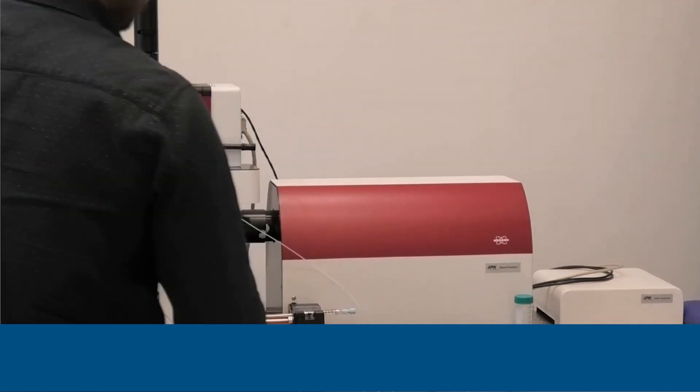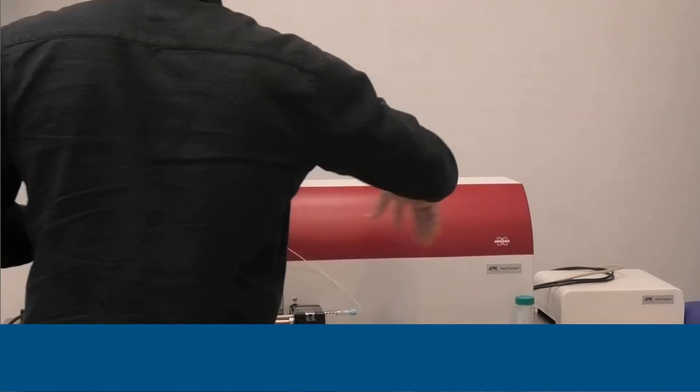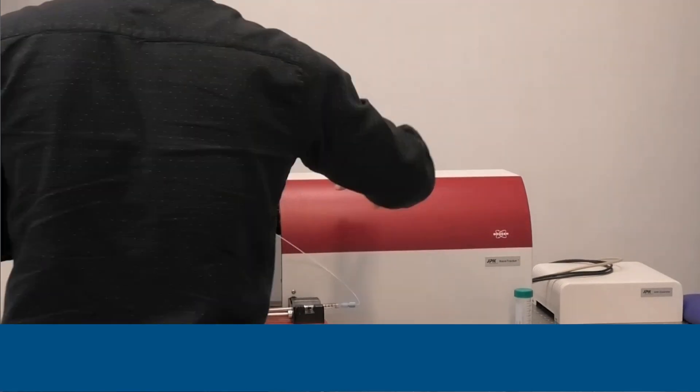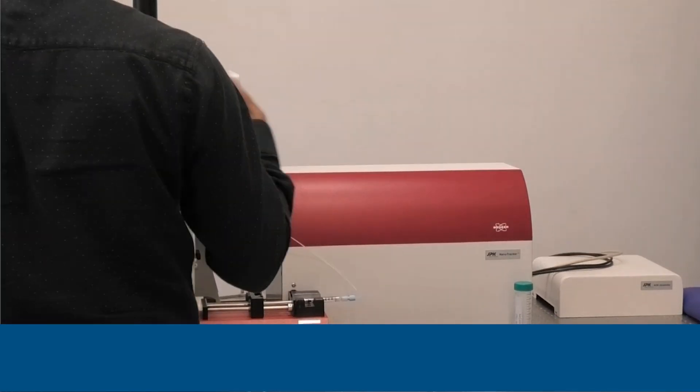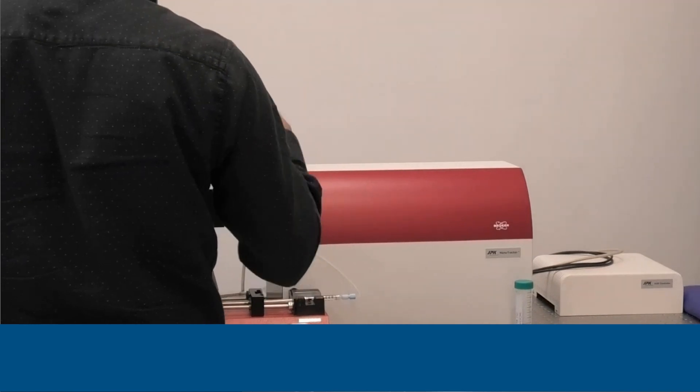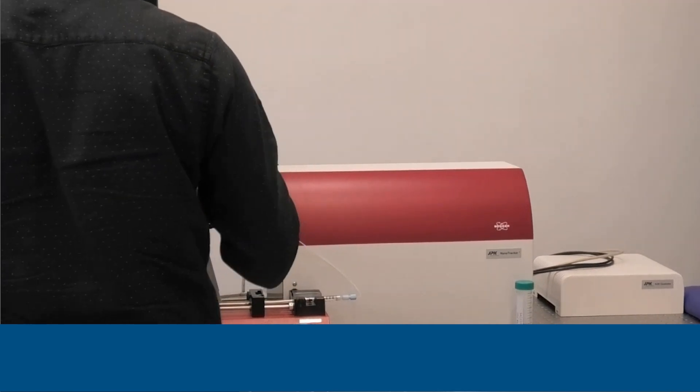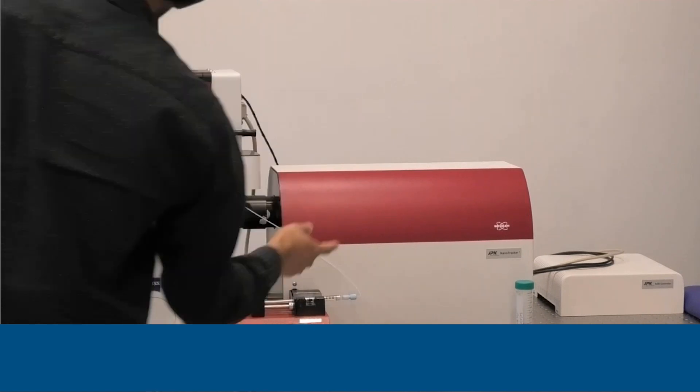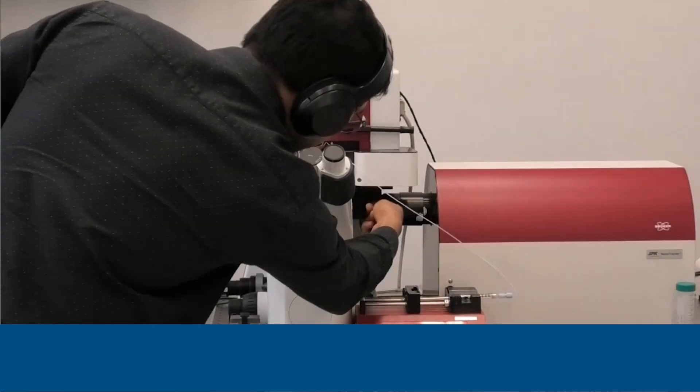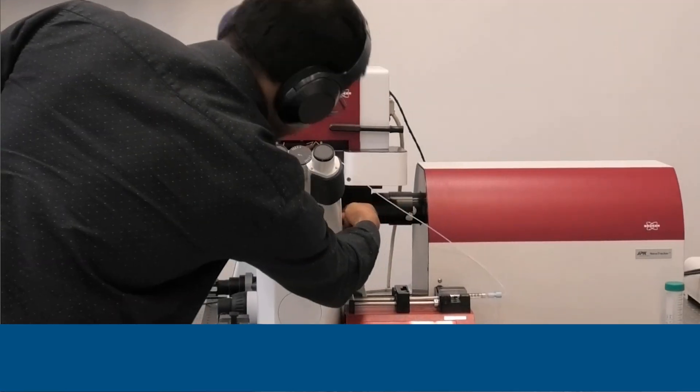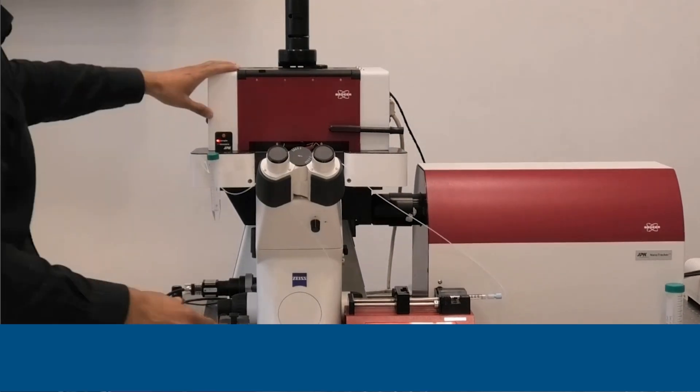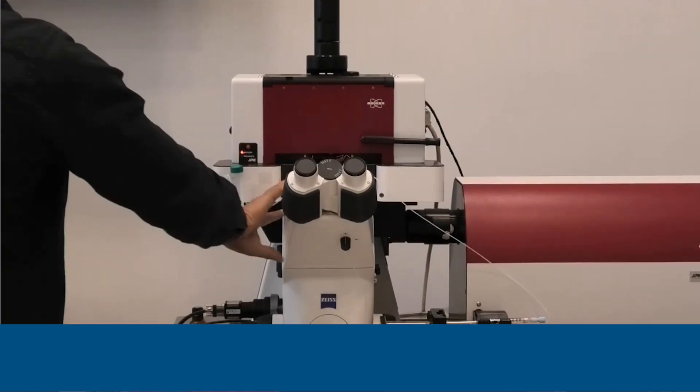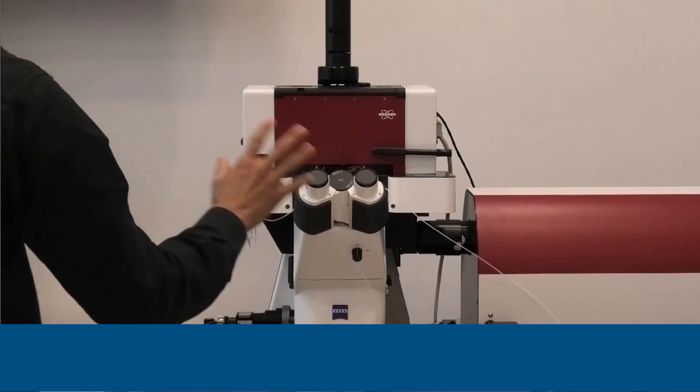We have different optical elements inside here to basically create multiple traps, as well as to steer or modulate your traps. Then the light is guided through an optical path here onto our microscope head, which is on the top of an inverted microscope. You could see here a Zeiss microscope.